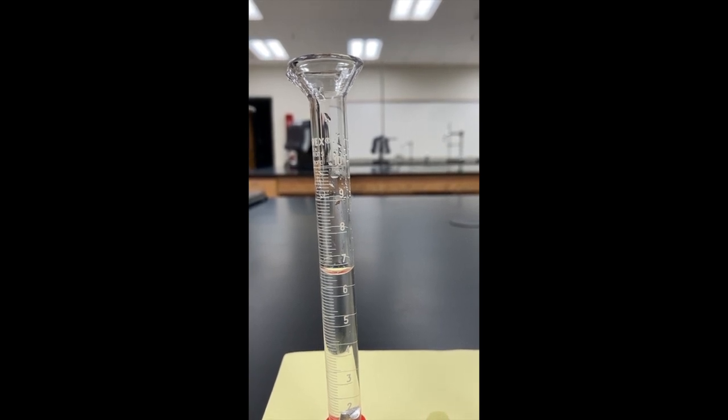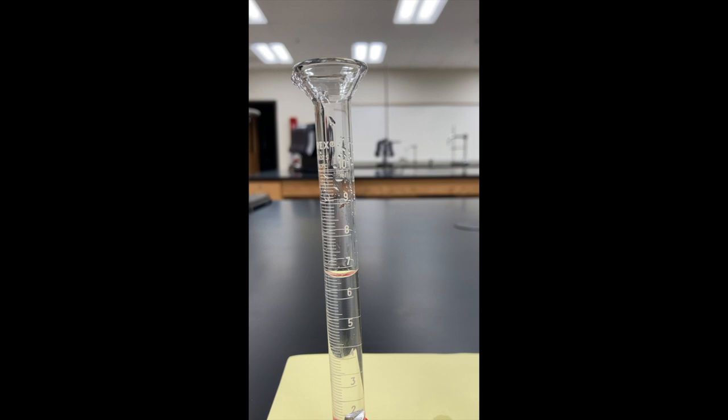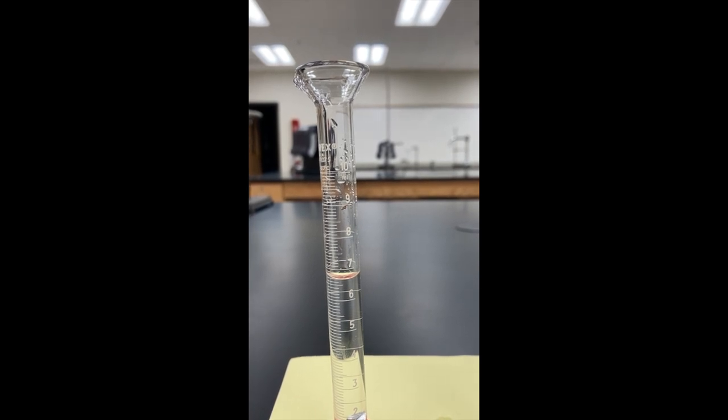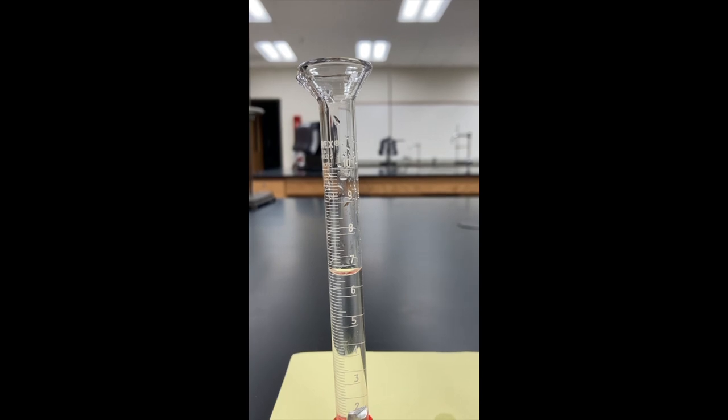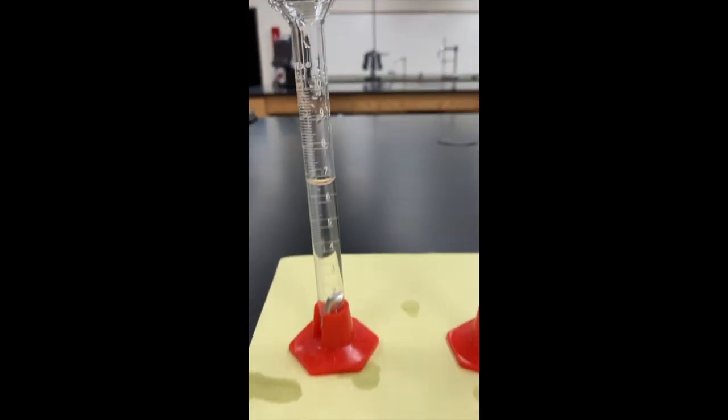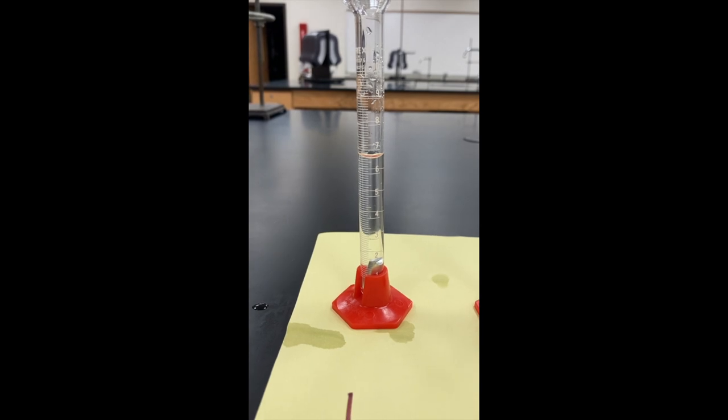Let's let that focus in again. Yep, about 6.7 milliliters, because you always read from the bottom of that water curve - the bottom of the curve is called a meniscus, and you always read from the bottom. So record 6.7 as your beginning volume for piece number one.